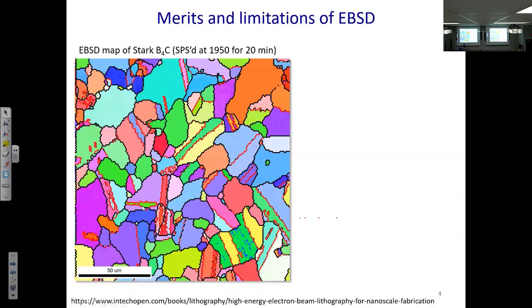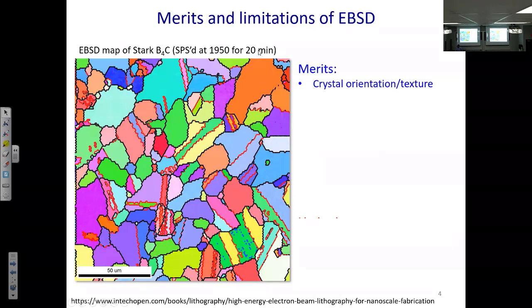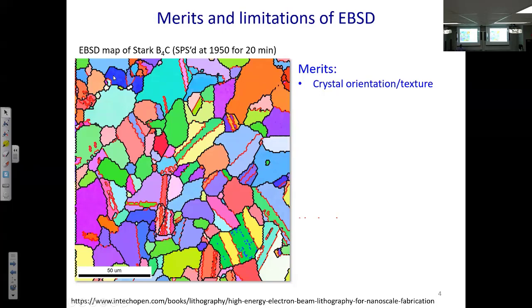Let's jump straight into orientation mapping. The example here shows an EBSD map of a ceramic called boron carbide. EBSD stands for electron backscatter diffraction. From EBSD you get a colorful map. The first type of information is crystal orientation and texture — each color corresponds to one orientation. In materials we deal with FCC, BCC, and orientations like 001, 011, 111. Each orientation gives one color, and grains with the same orientation share the same color. EBSD also tells us texture — whether grains are preferentially aligned or randomly arranged.